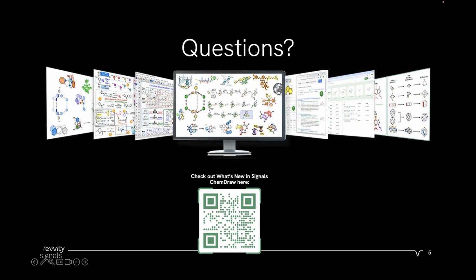So it'll see, hey, here's a Word document, here's Excel, whatever. If there's structural content within those files, it'll show you what's in there. You don't have to upload anything at all. There's no manual work required for that.